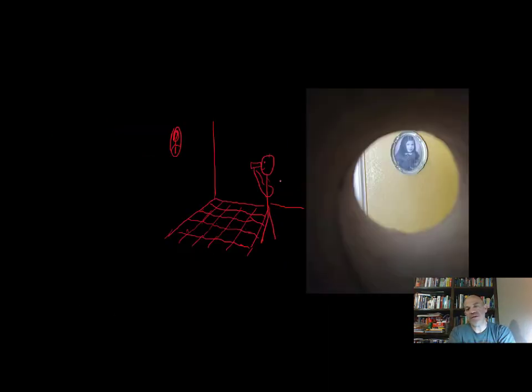Now, to use another example of what actually happens in the microscope, the problem with the microscope is that the size of the plate changes, right? It's like if I'm going to zoom in, then I'm going to see less and less of the plate. So the circle changes in diameter. So here's an example. What I did was I took an image through a cardboard tube, like the kind that toilet paper comes in. I put that tube up to my face, and I put my phone right behind the tube and took a picture of the wall there. And when I did that, this is what I saw.